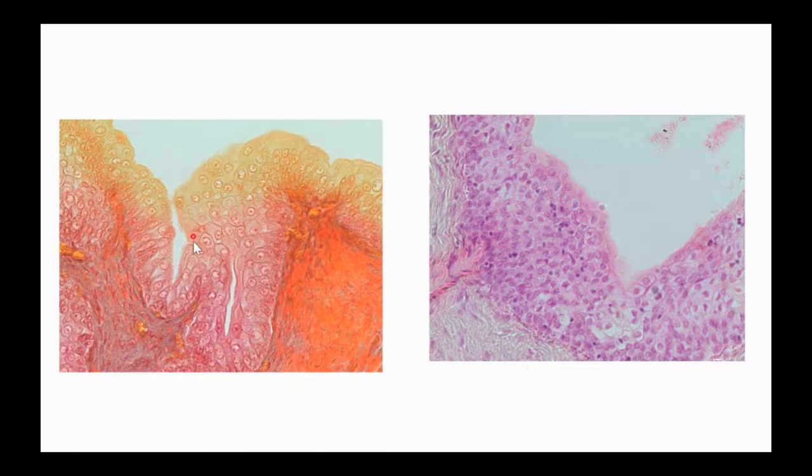So see here on the top how it's kind of bubbly and how these cells are kind of expanded and large. If we look over here, we've kind of got these big puffy cloud-like cells on the top. So the other way to think about transitional epithelium is we've got these big puffy cells. These are what the cells look like when your bladder is empty. So they're as big as possible.